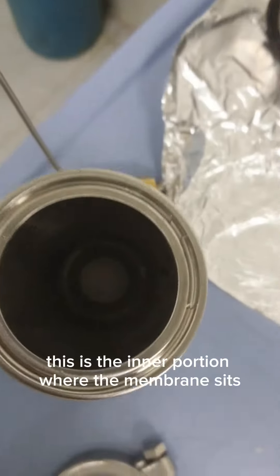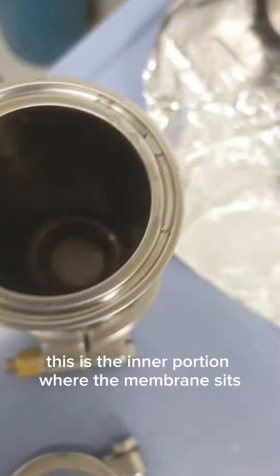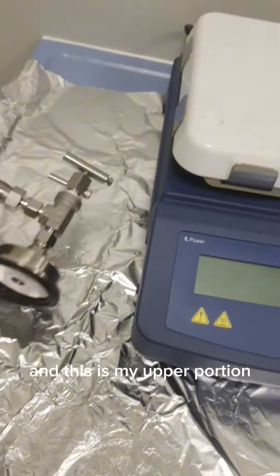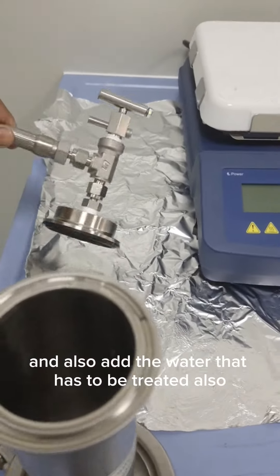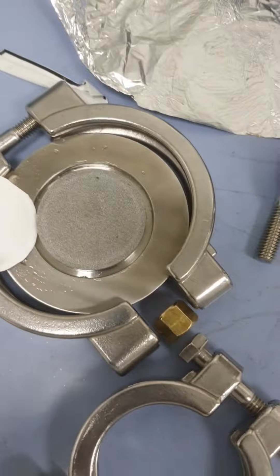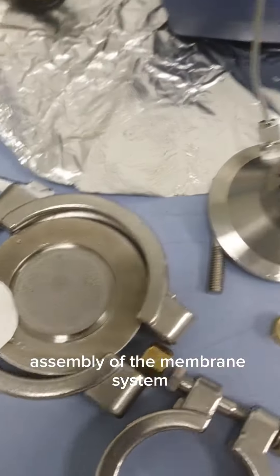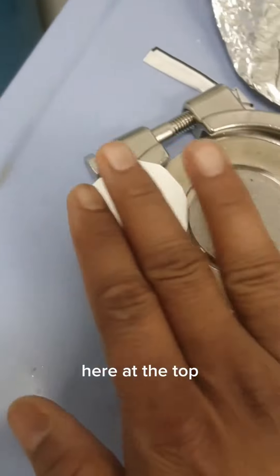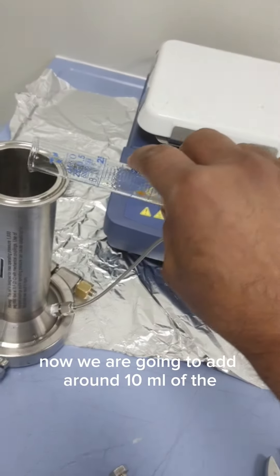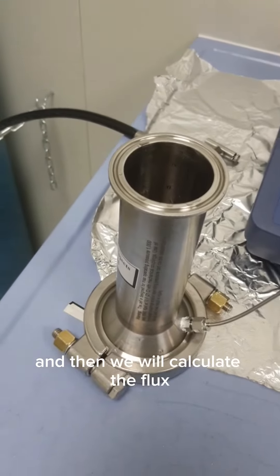This is the inner portion where the membrane sits. You can see I have already placed the membrane, and this is the upper portion — I will cap it up and also add the water that is to be treated. This is the inner assembly of the membrane system. At the top we put the membrane and then cover it. Now we are going to add around 10 ml of the sample here, and then we will calculate the flux.